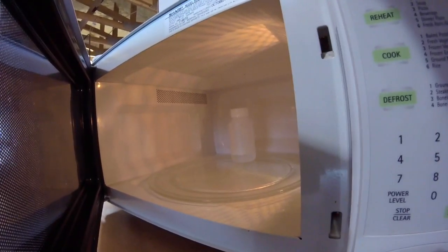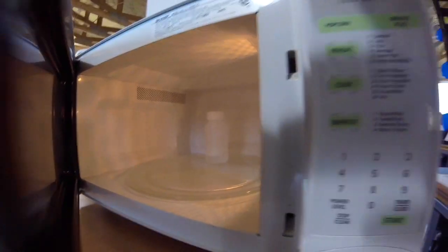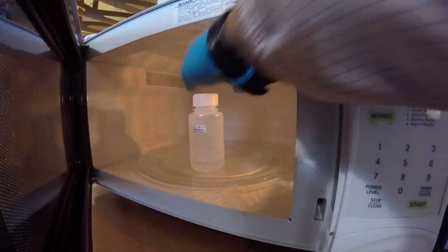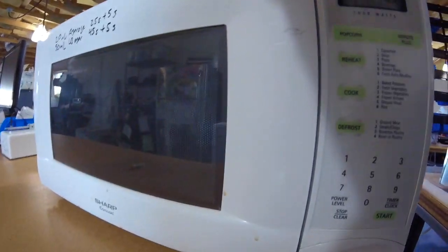Okay, so you can see that it is not rolling. There's no rolling boil yet. So we're going to go another 5 seconds. There's this very slight rolling boil in this one. We're going to go a little bit longer. You definitely want to see it boiling.